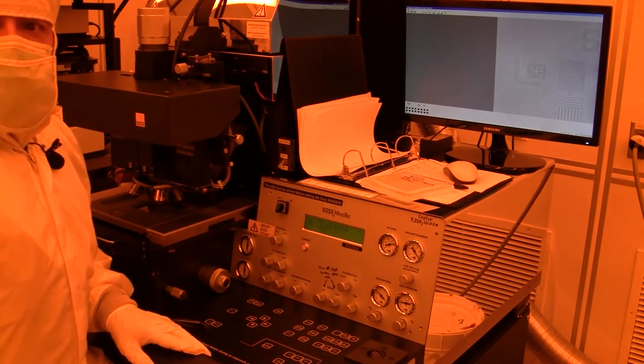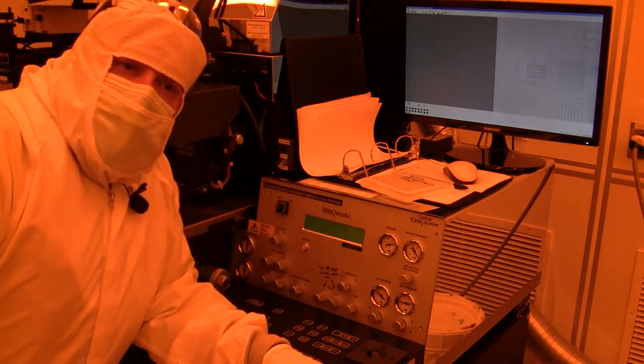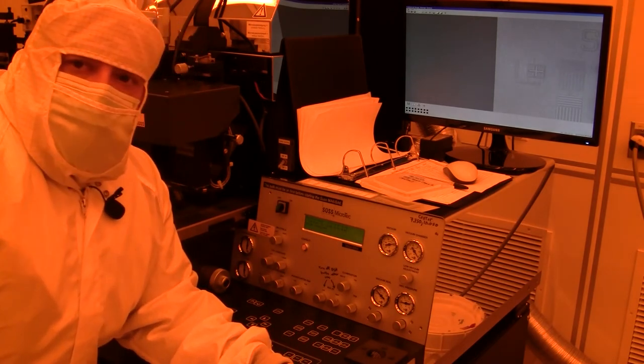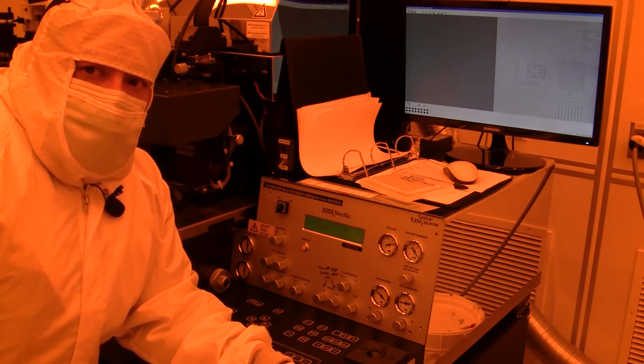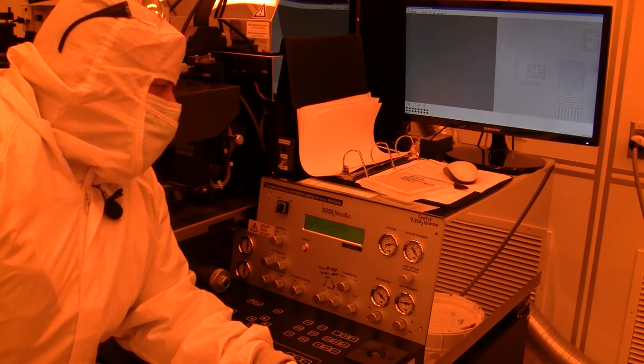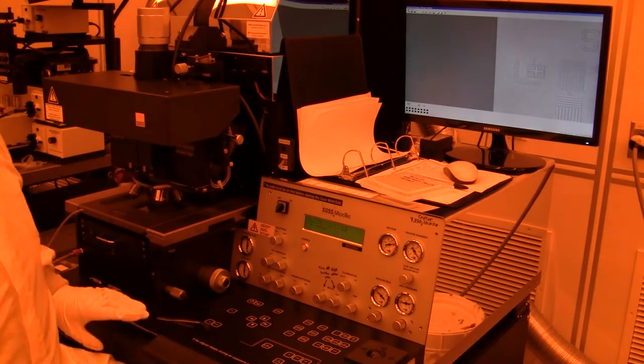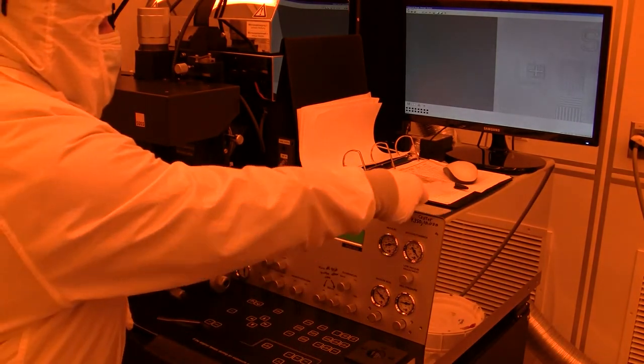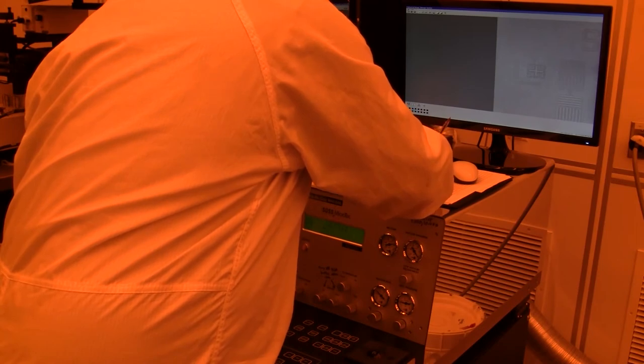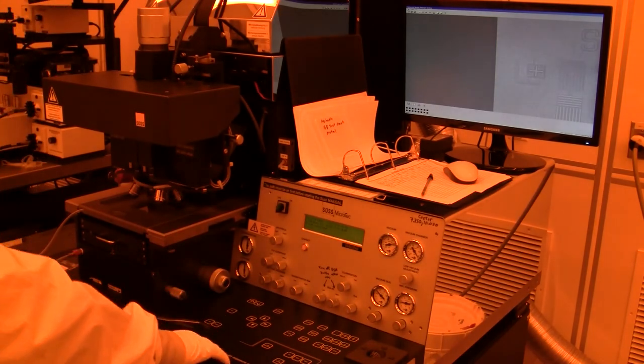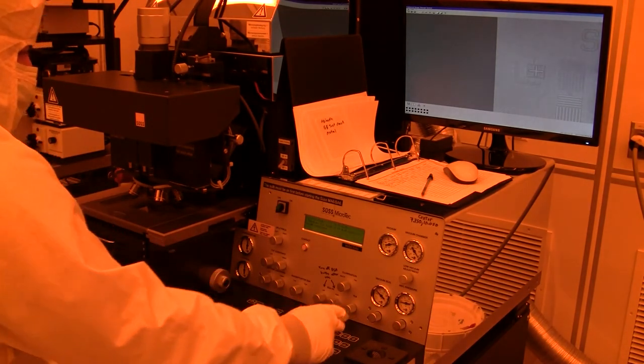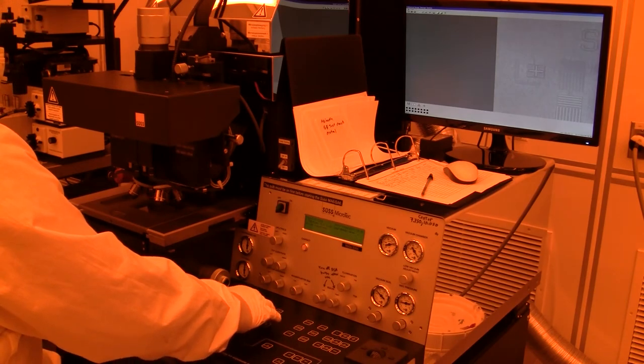So now we're ready to do an exposure. So what we're going to do is check our parameters. The exposure is a function of the photoresist. Thicker the photoresist, usually more exposure time, and this is ultraviolet light. So I checked our handy dandy log book, which is currently 1813, 12 seconds. So I'm going to change this parameter to 12 seconds.